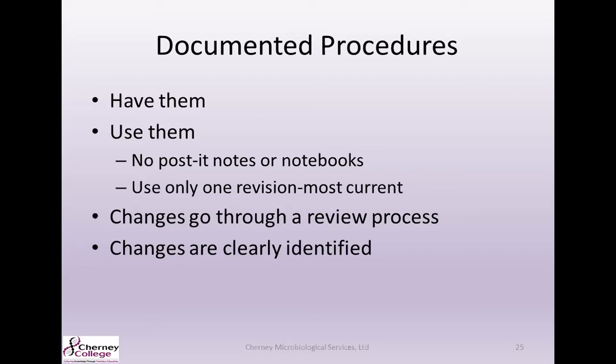Also make sure that they're not using any Post-it notes. Any documentation about the samples should be written on your bench sheet, somewhere other than a Post-it note that could get lost. All changes need to go through the quality system. They should be reviewed frequently and make sure that all techs are aware of any method changes or updates.